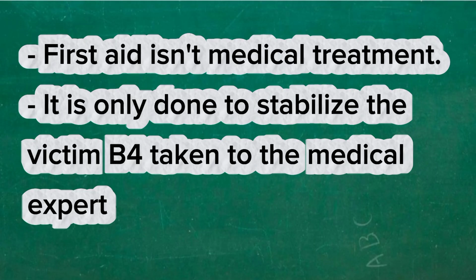So first aid is not medical treatment. Remember that first aid is not a medical treatment. It is just done to stabilize a victim before being taken to a medical expert. So unapofanyia mtu first aid, that one is not enough. Mfanyie first aid na umpeleke wapi? Hospitali, ili aweze kuangaliwa zaidi.